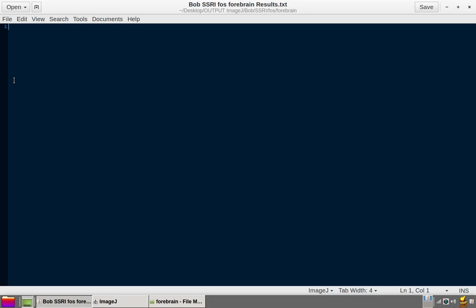To monitor results it's important to use a text editor that dynamically prompts users upon changes to the open file. We recommend the free and open source programs Notepad++, Genie, Kate, and in this case G-Edit or Getit.